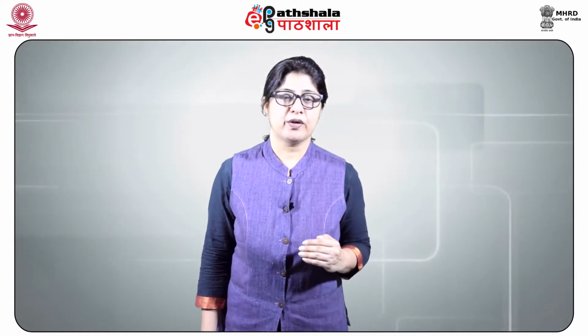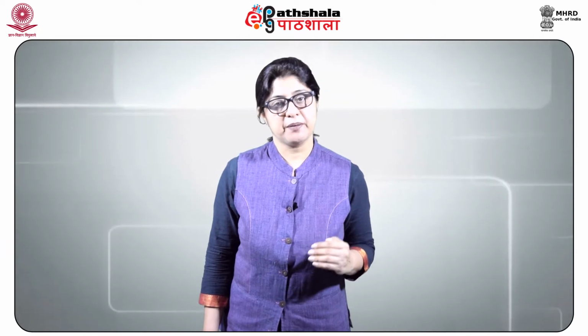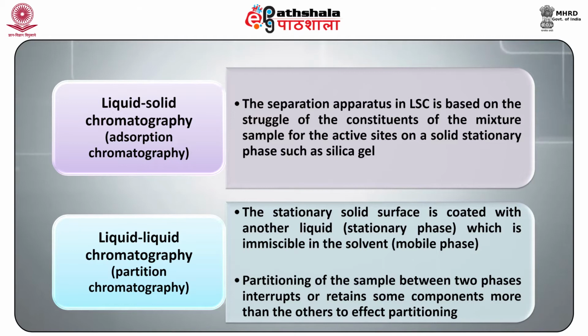Types of liquid chromatography methods. Liquid chromatography methods are named according to the mechanism involved. Liquid solid chromatography, also called adsorption chromatography. The separation in LSC is based on the struggle of the constituents of the mixture sample for the active sites on a solid stationary phase such as silica gel.